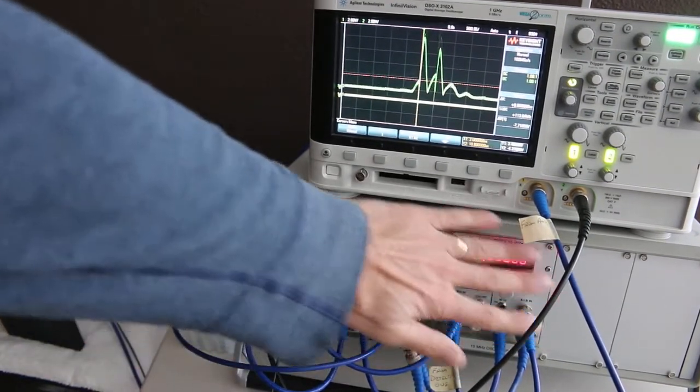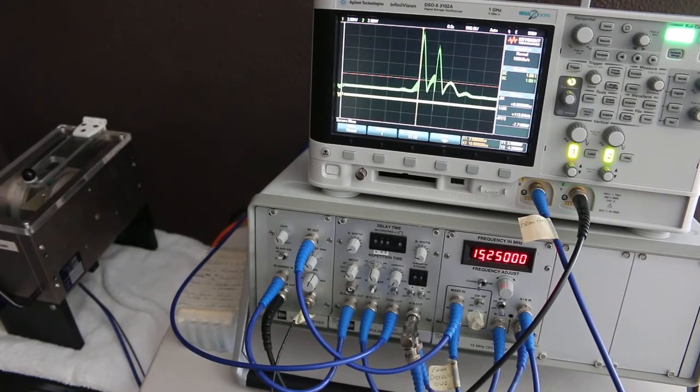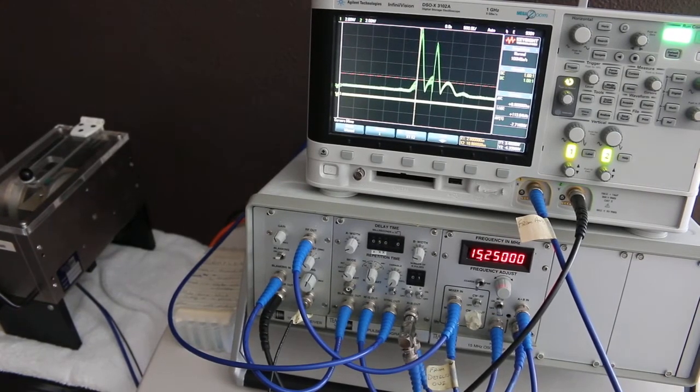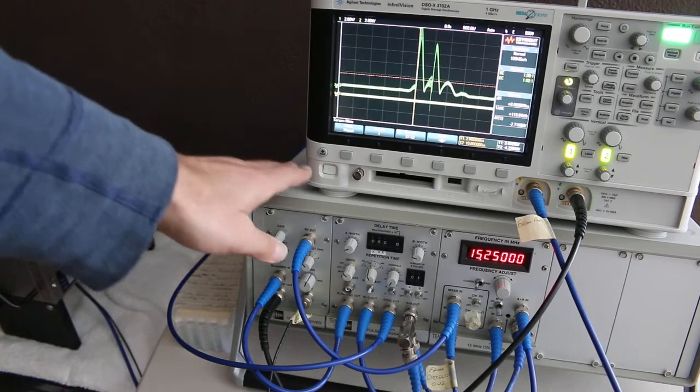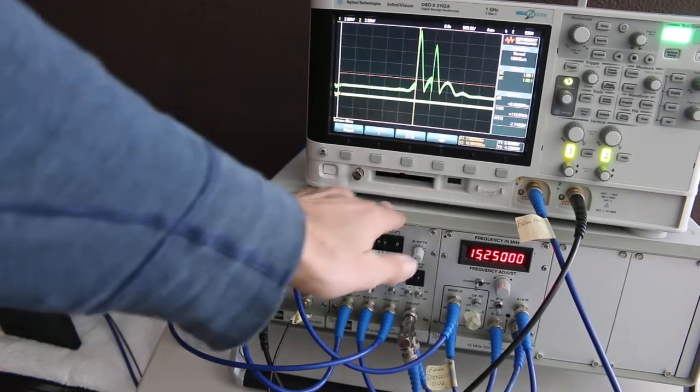Part two down here is the big control area right here, sort of how you run your experiment. And you can definitely think of this control unit as consisting of three parts here, one, two, and three.